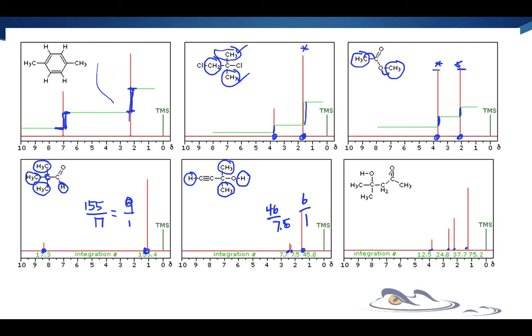Okay, so can we see them up here on our graph? There's 1 environment. Here's 2 environments in the structure I meant. And here's 3 environments. And there's another environment. And I noticed that this one, these 2 are probably together, huh? That's probably all 1 environment right there. Okay, so I found my 4 environments.